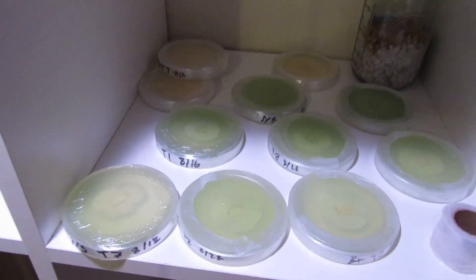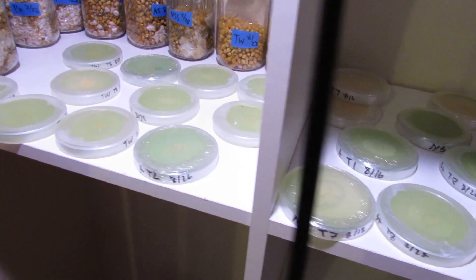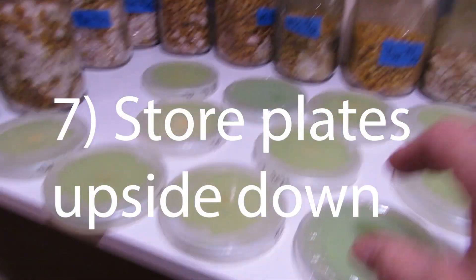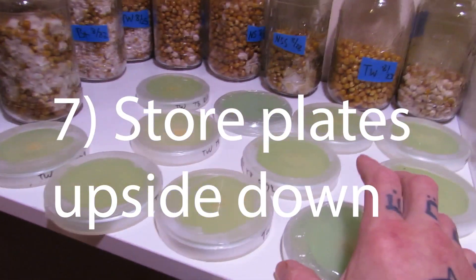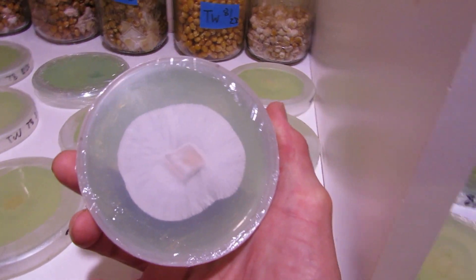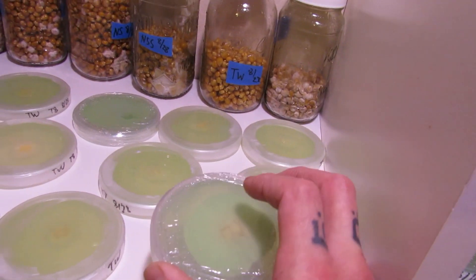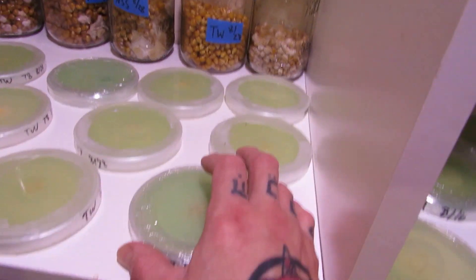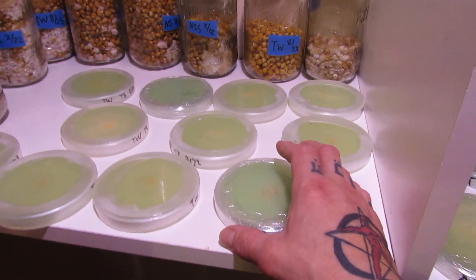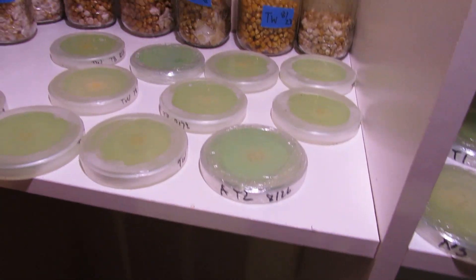Number seven: this one has been really helpful. You'll see how I have my plates stored upside down. Having the condensation water that's in there facing downward means it's not dripping on your sample. It's just going to help keep your culture clean for a little bit longer.